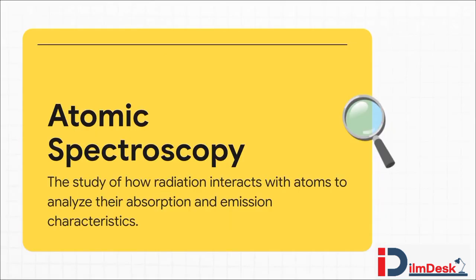Okay, try to picture it like this. Every element in the universe is like a tiny, unique tuning fork. And when we ping it with some kind of energy, like light, it rings with a very specific set of notes. Spectroscopy is basically the science of listening to those notes. By analyzing the music, the light an atom soaks up or gives off, we can tell exactly what it is. It's just a really beautiful and elegant way of investigating the world.